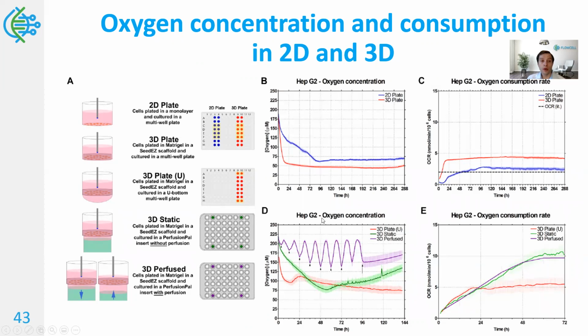So in summary, this model combining highly oxygenated three-dimensional scaffolds with the right type of matrix and cells can be an efficient means of biocomputing liver toxicity or liver efficacy also, for example, in NASH.